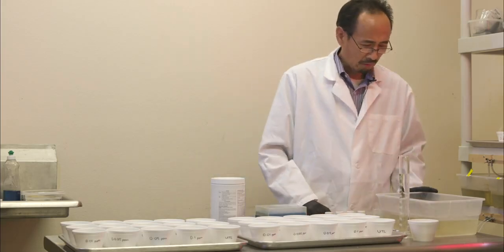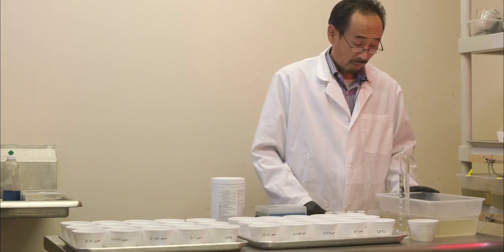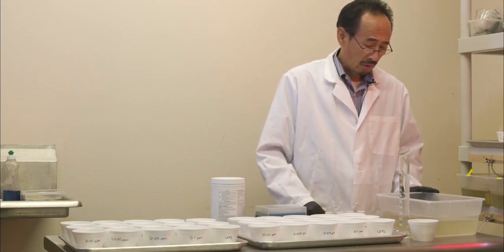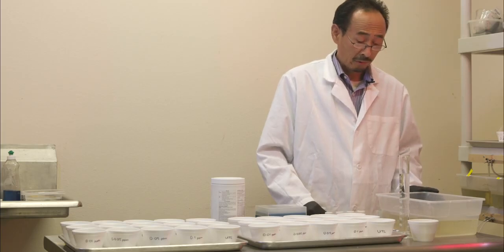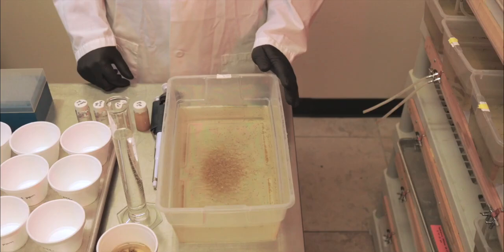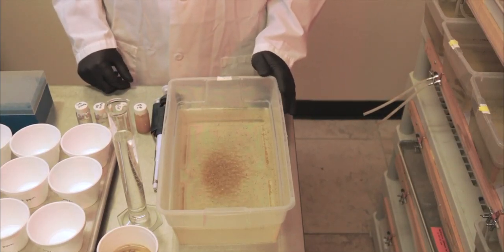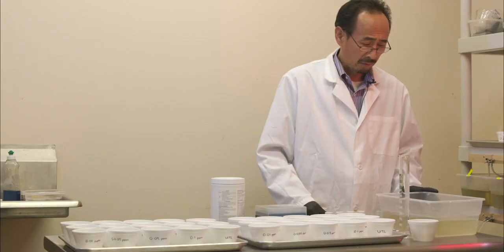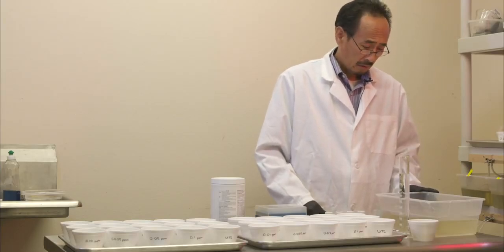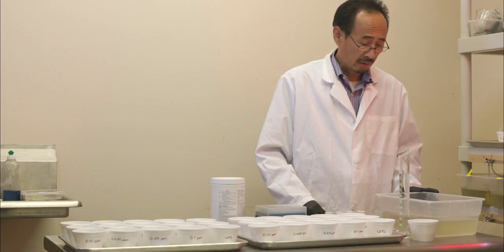Then, of course, the mosquito larvae of your interest or your concern. For practice purpose, the easy start, you can use the mosquito larvae from your laboratory colony, which you have a better control for the biofitness, their instars, and other factors. Of course, you can also bioassay the larvae of unknown, basically from the field or from any other source you want to find out their susceptibility to BTI.